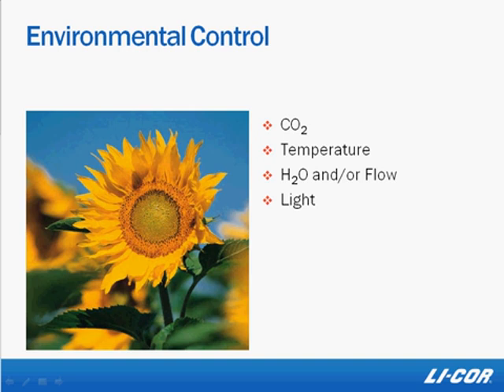If your temperature is at all changeable, control leaf temperature to a constant value. If you're working in a temperature-controlled environment like a growth chamber, you can skip this. Otherwise, you do need to keep that in mind. For water control, we're going to use a constant water mole fraction and let the instrument adjust the flow rate for us. This will make sure that the plant's stomatal response isn't influenced by changing water levels.